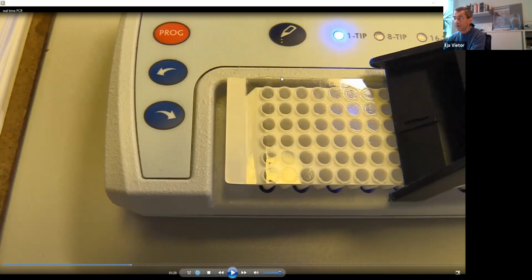So you have to be really careful that you have enough material of this foil completely covering your sample. Our samples are these 12 samples here on the top. That was the reason why I left a bigger leftover. It would not be good here where you don't have such a good contact. You can lose these samples.